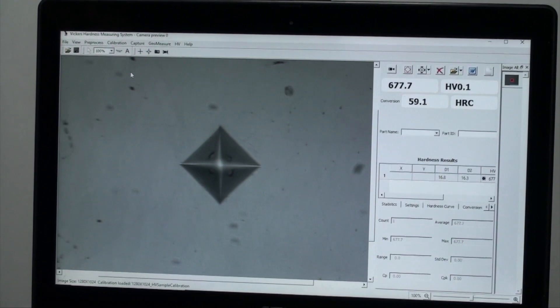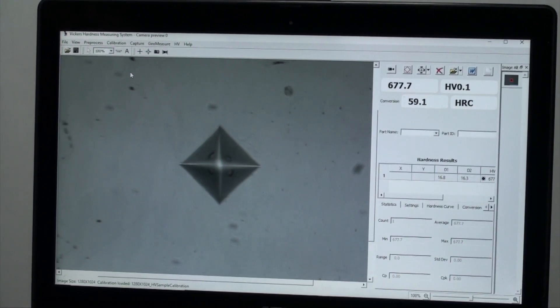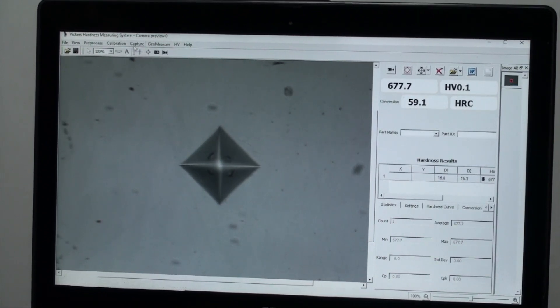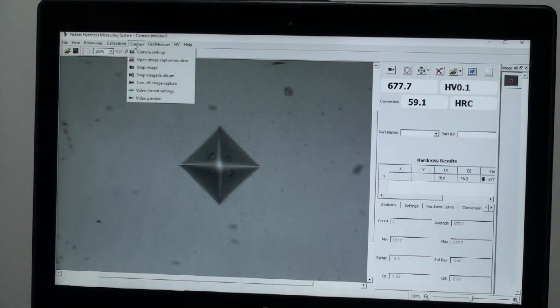Now let's make sure the digital camera system is working and connected. On top left click on capture, then click on image capture window.